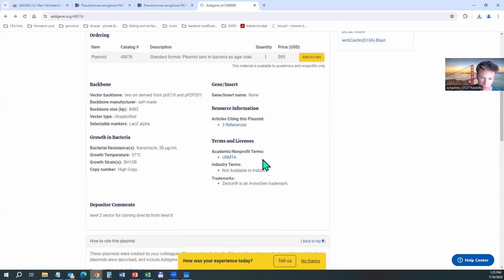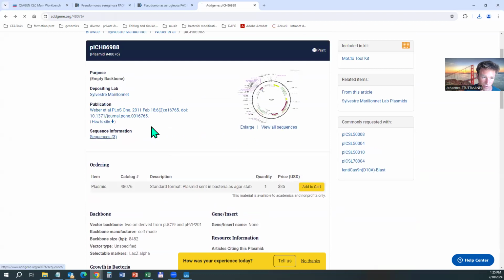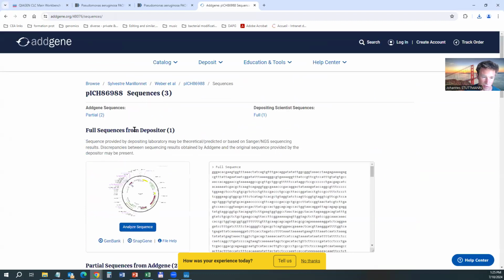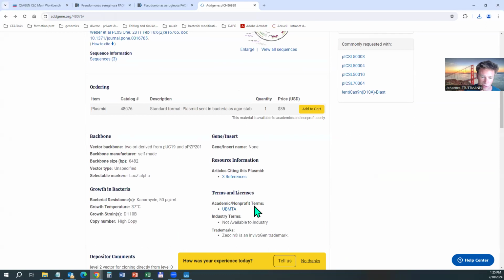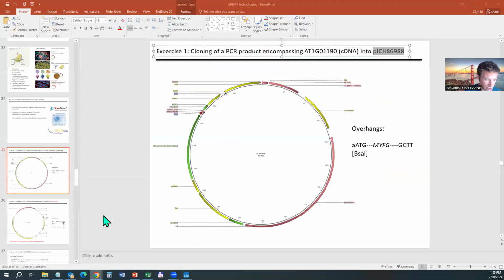Depending on the depositing person, you can sometimes have additional data here, yet another sequence file, and sometimes the degree of annotation, the degree of information in these files can be quite different, because from this link here, you may get only limited annotations, while the second link may provide more. But this depends really on a case-to-case basis. So it's now in my download folder.